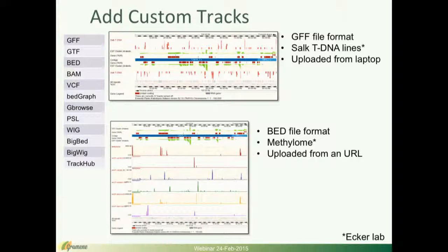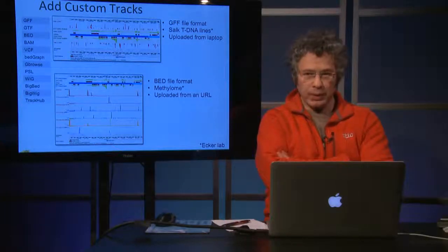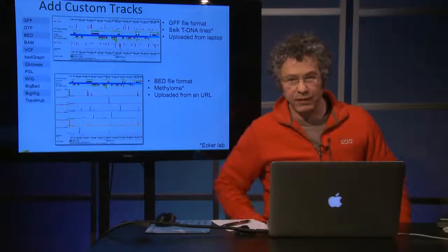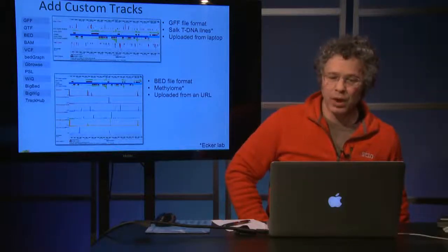Okay, the final topic I'm going to cover today is the ability to add custom tracks. So if you have your own data that you've generated and you want to view it in a browser in the context of other annotations that are available in Gramene, there are ways to upload your data.